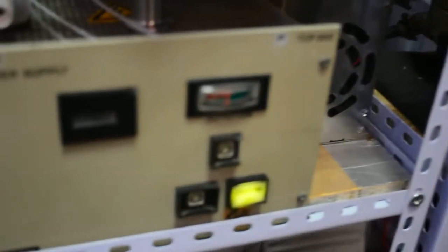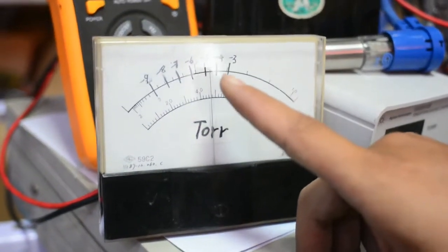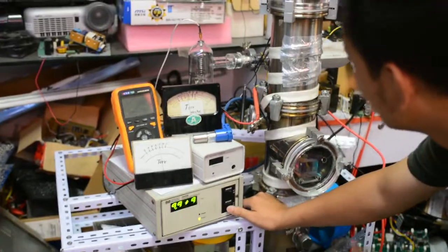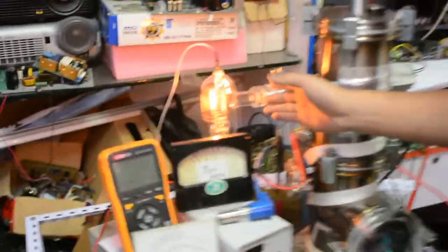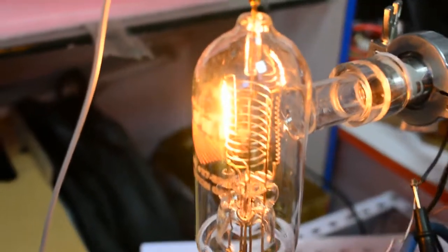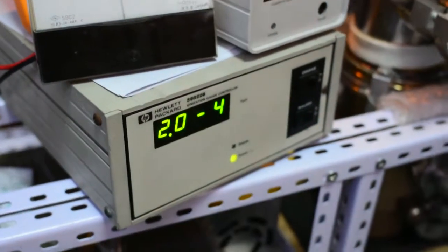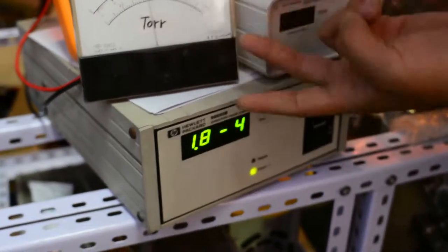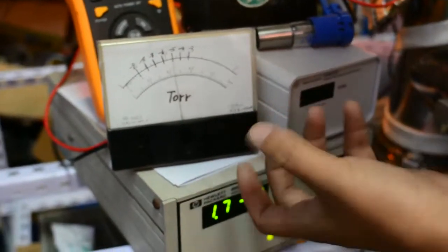You can see the needle drops very, very fast. Now I can turn on the glass bulb ion gauge — one, two, three, on. You can see it is a glass bulb, and when it's turned on, I can read out the vacuum directly on the display panel. It's very, very accurate. However, there is a different readout between these two gauges for the vacuum level.